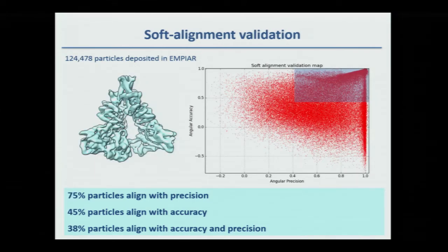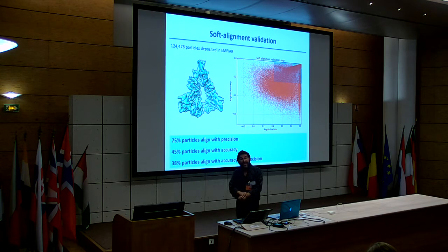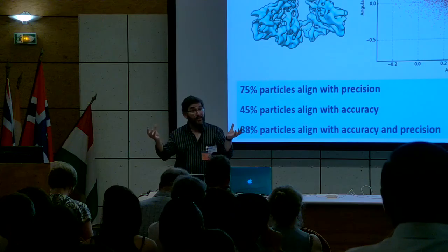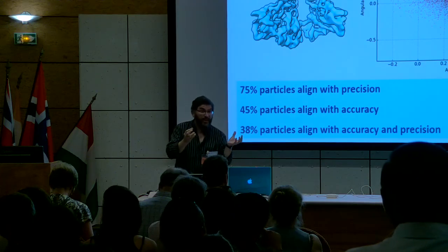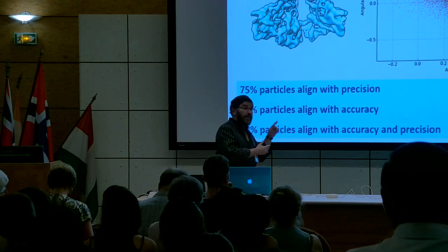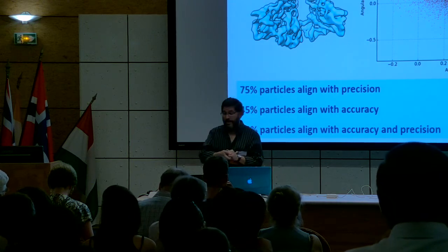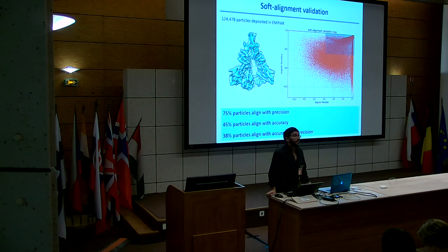So if you use your orientation, and their data and your structure, did you get that? If I get their data, that was quite difficult to get, their map, and with their data and their map, I calculate the orientations, and I do this sorting of orientation according to these principles, this is what we get. So you could get this structure? In principle, yes. I mean, this map, yes.